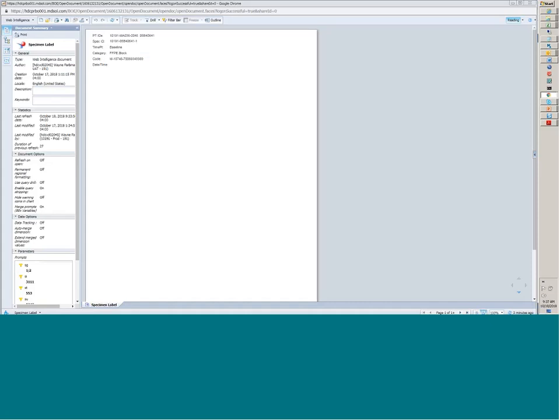And at the bottom of this screen, it says page 1 of 1+. If we click the go to the last page icon, it will tell us how many labels are going to actually print, and there's seven of them here. Remember that we had entered, I believe, 3 labels for the tissue specimen and 4 for the blood sample. And so here we're looking at the 7th label now.